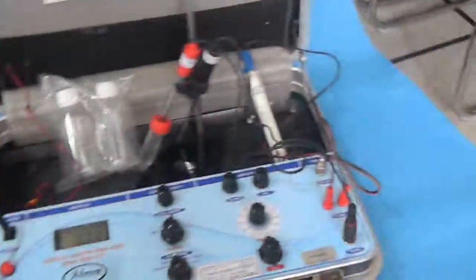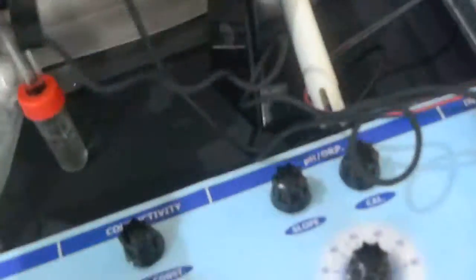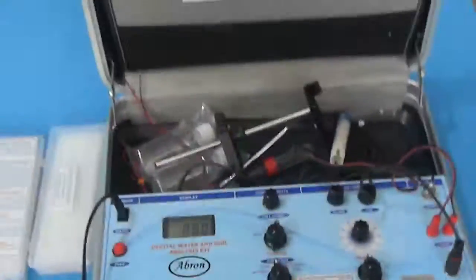This comes in a very handy portable mode which is a briefcase. And you can put all these sections inside. So all can go in one shot. And then you can use it in the briefcase mode, portable, even in the lab as well as the portable mode is there.